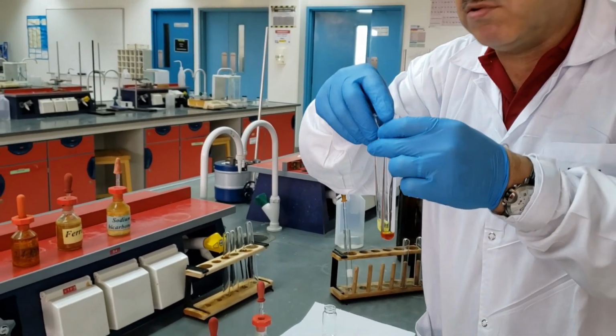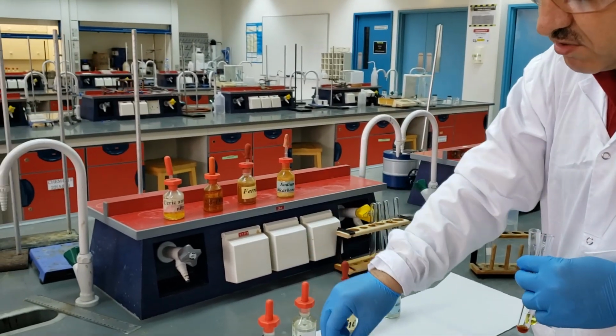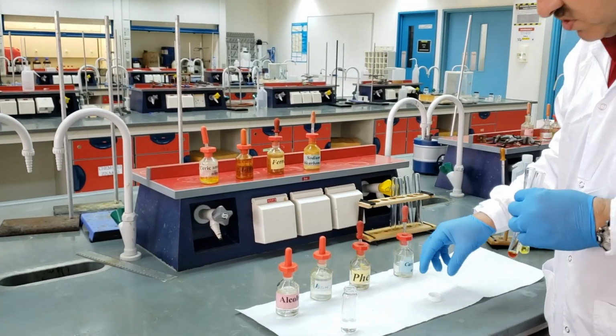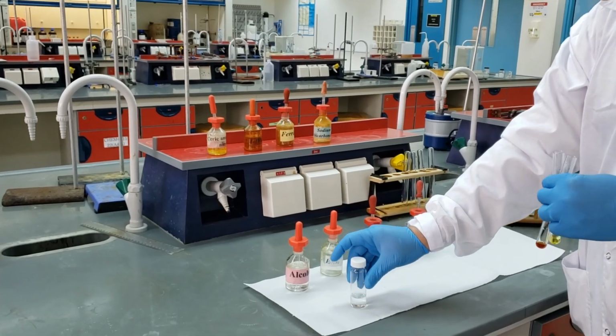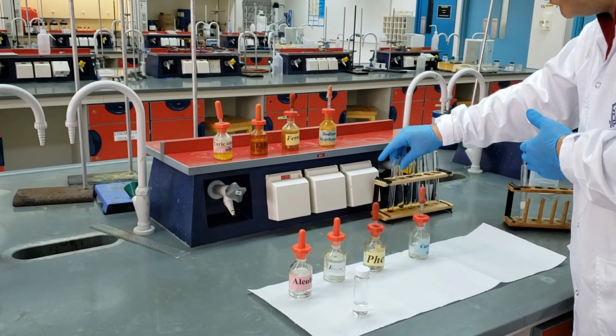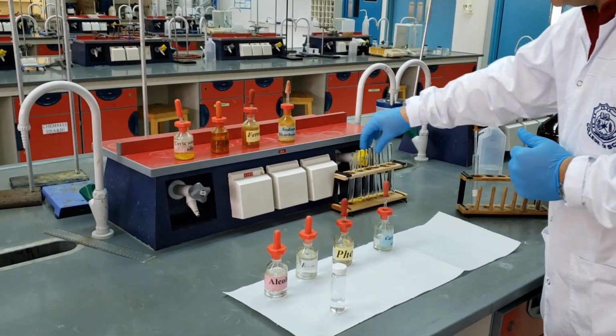My conclusion is that my unknown compound does not contain the same functionality as this known compound, which is alcohol. That means my compound definitely contains another functional group. So I should simply continue and repeat everything until I find a match of my unknown with a certain known compound.